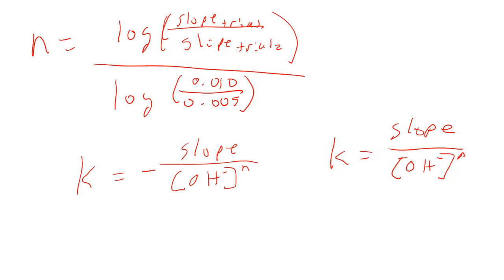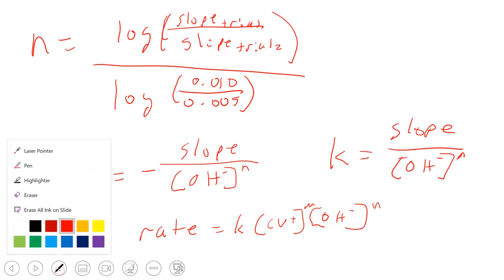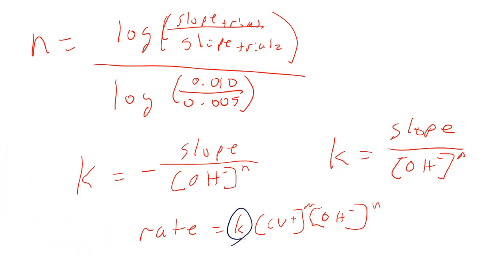And then in question 4, you're going to write out your experimentally determined rate law, where you're going to give what the values for k, m, and n are. So k, m, and n here are going to be replaced with the values that you came up with. So this is what you will need to do for your crystal violet lab experiment once you have all of your data. So make sure you have submitted your purpose and procedure on Canvas before you come to lab, and I will see you in lab.